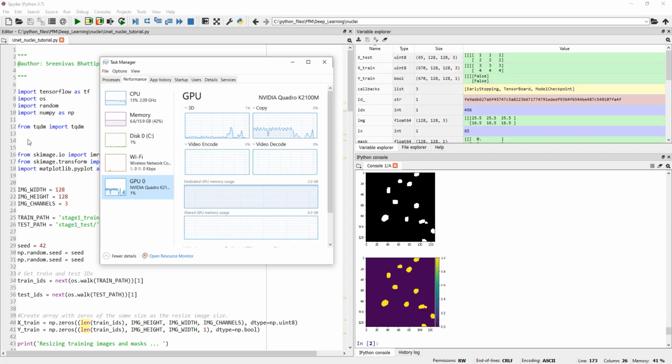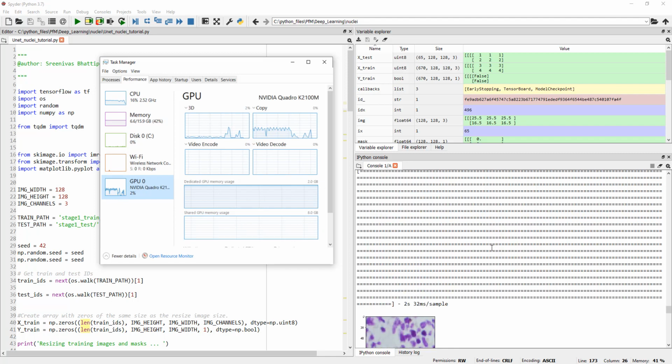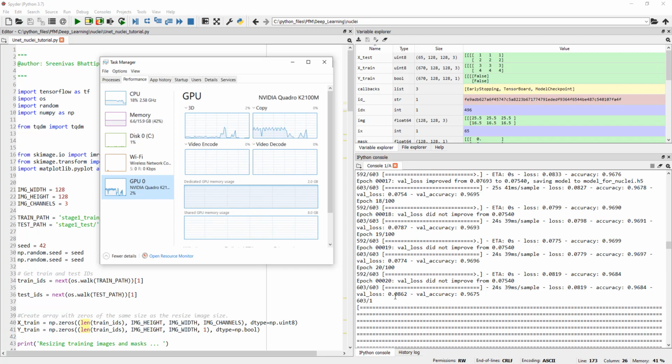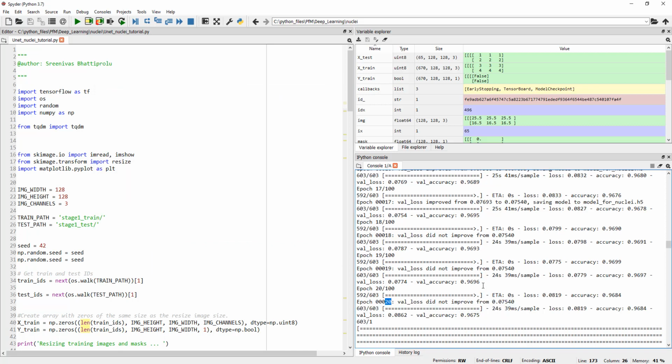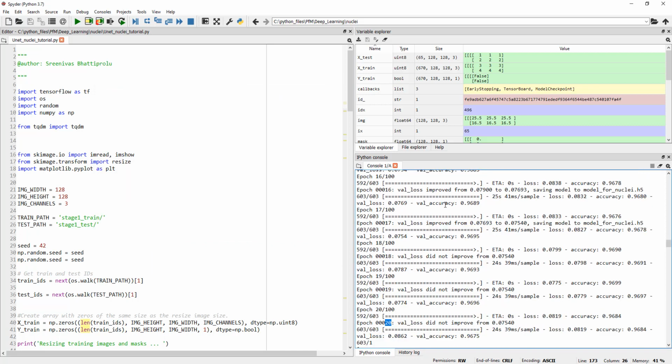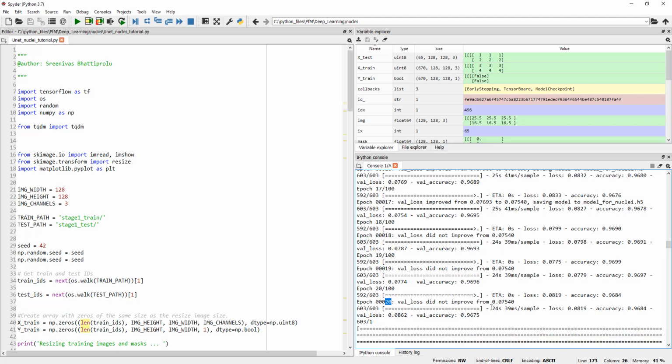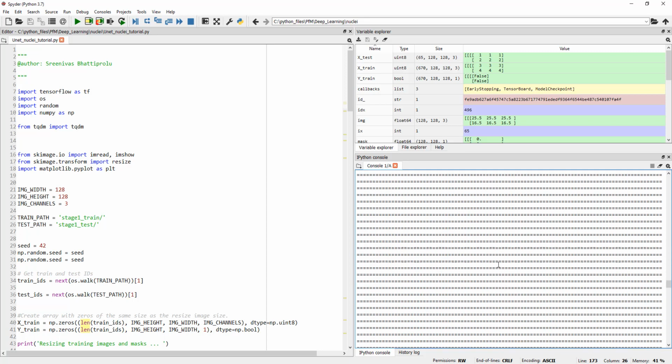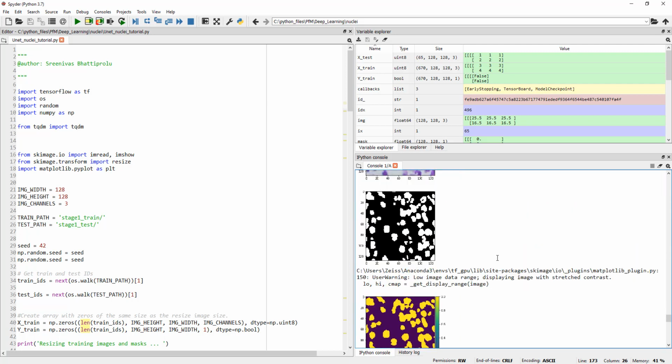So here you go. It actually stopped before 100 epochs. So let's go back up and see when it actually stopped. This happened after, if I can see it, epoch 20, right there. Okay, so you can see the validation accuracy 0.968995. It's getting better, but then 93, 96, 9675. Now it's printing a few of these images down here.